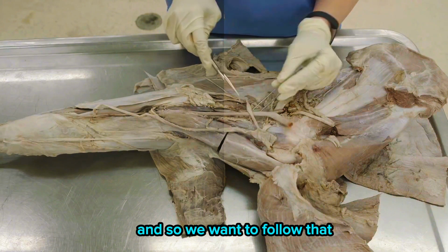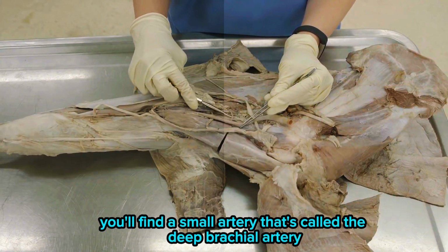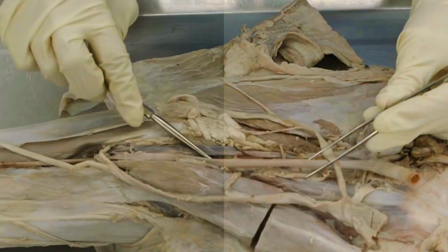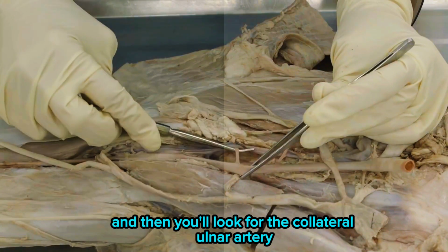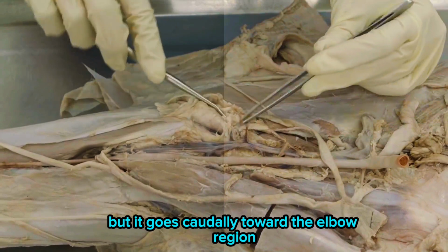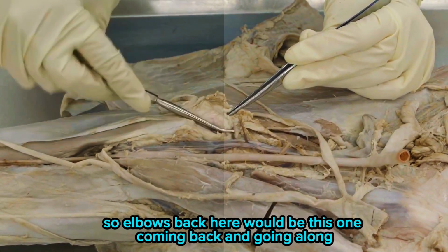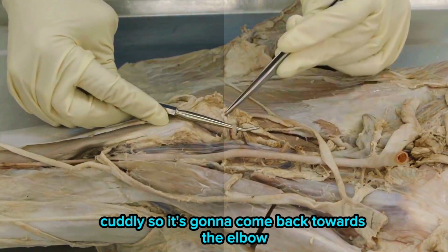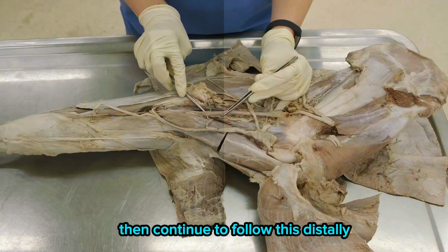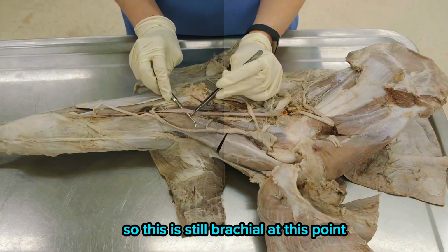And so we want to follow that. As you do so, you'll find a small artery that's called the deep brachial artery. That'll be a small branch coming off caudally. And then you'll look for the collateral ulnar artery. It's kind of a small branch as well, but it goes caudally toward the elbow region. So elbow's back here, and this one comes back and goes along caudally. So it's going to come back towards the elbow. So collateral ulnar artery there. Then continue to follow this distally. This is still brachial at this point.